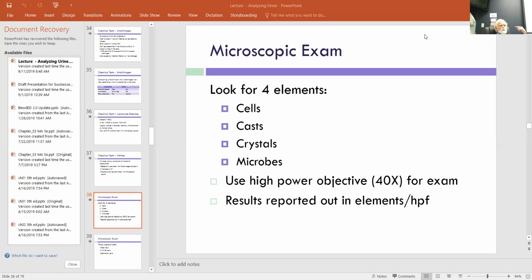There is a higher magnification on the microscopes, but that's an oil lens, because the higher the magnification, the dimmer the image is, and the oil makes the image a lot clearer. We will not be using that in this class. We use it in microbiology because some things are best visualized that way. And quite frankly, some structures are too big to use that much power.